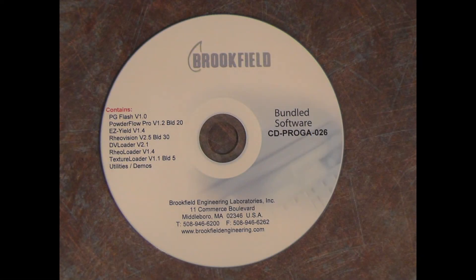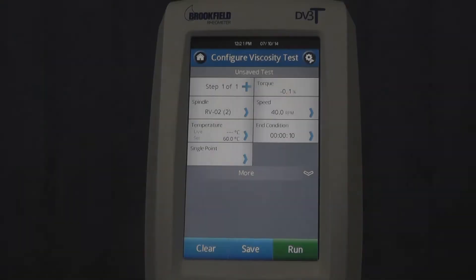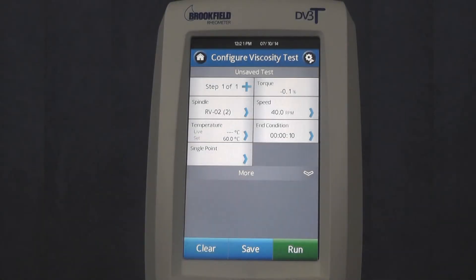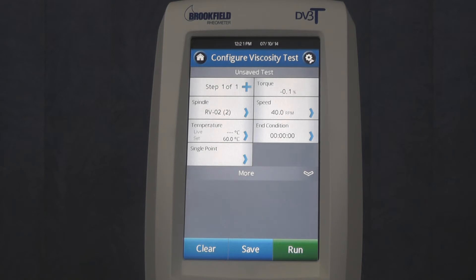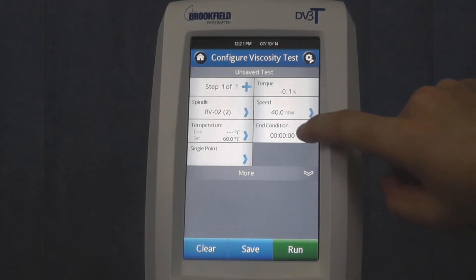By doing it this way, you would need to have an end condition that, once satisfied, would end the initial step and move on to the next program step. There are six end conditions, but for this example, we'll use an end condition of time.